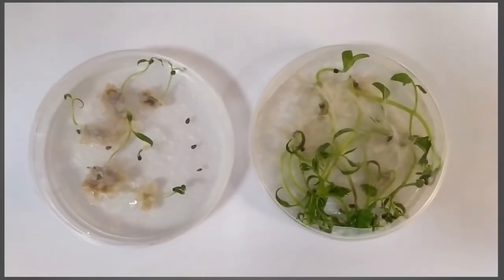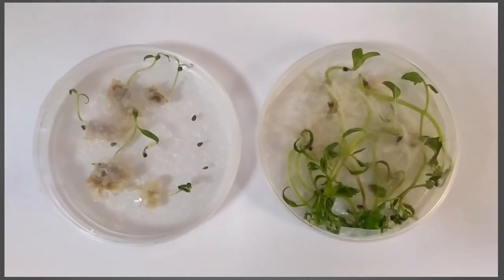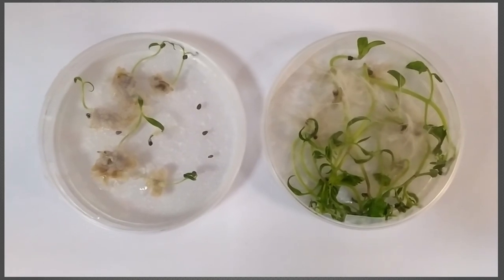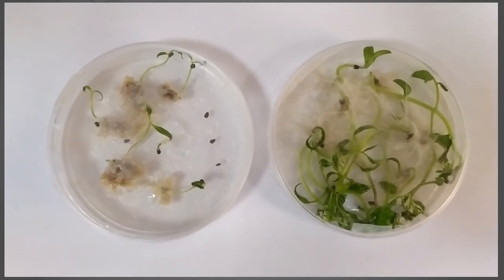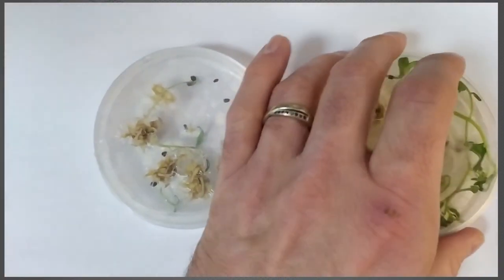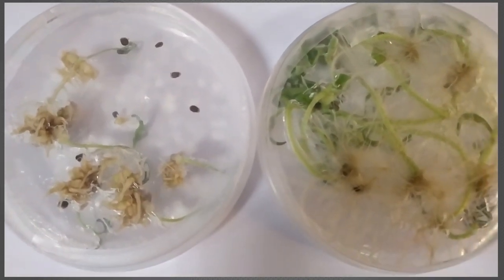Here we have two plates, both containing media, but we have two very different growth characteristics here. On the right-hand side we have a very typical germinated seed with lots of leaves coming up. It's been three weeks, so we have some true leaves growing in here, stems and all that stuff. On the left-hand side we don't really have the same sort of characteristics, but what we do have is something unusual. If you look at the underside of both plates, you can see that the roots are very, very different.